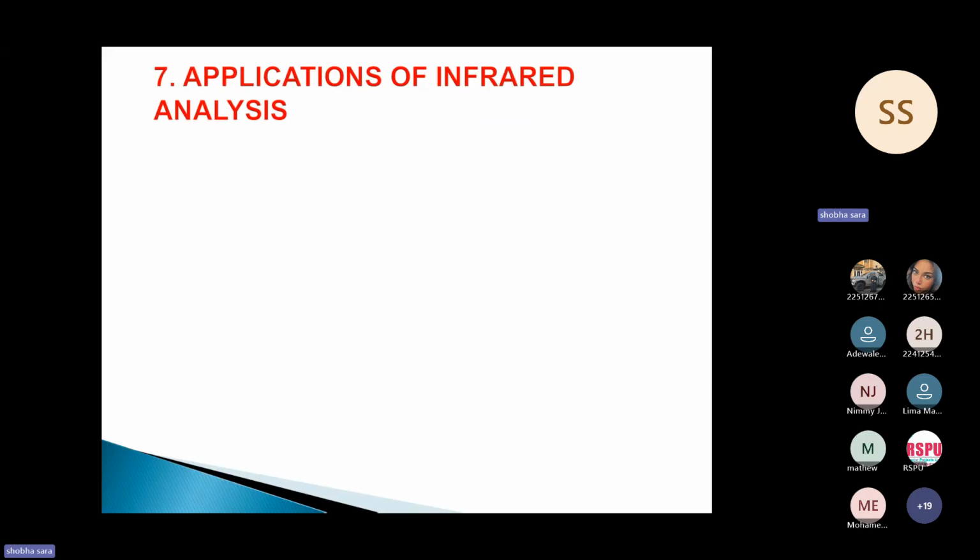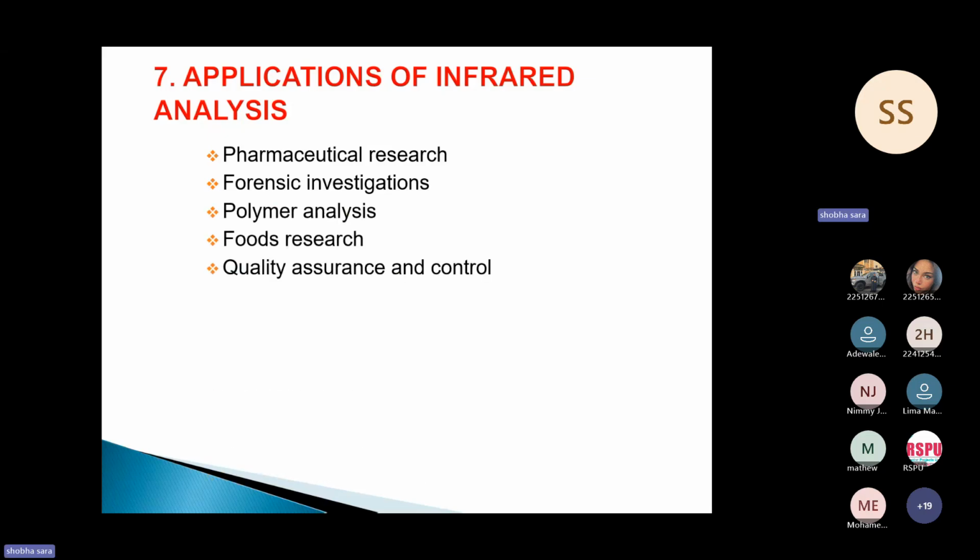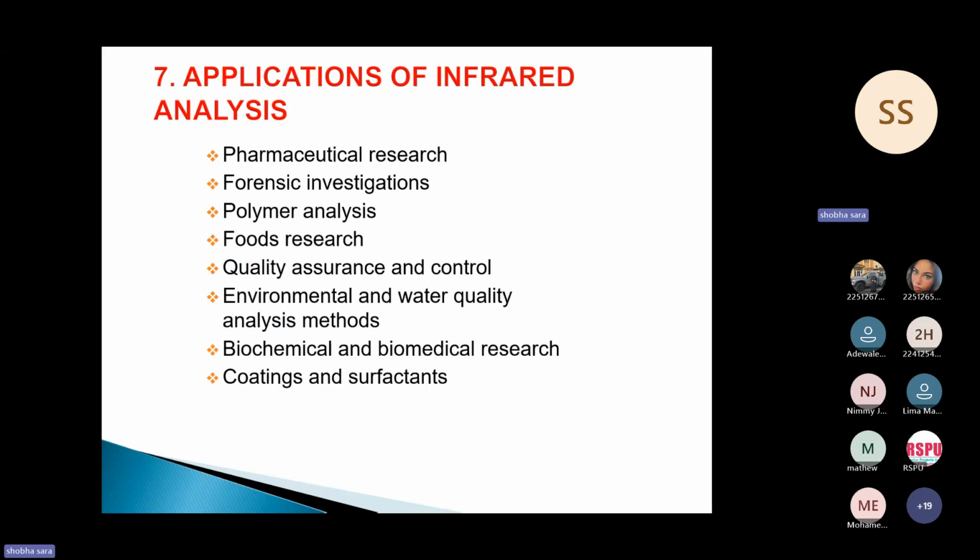Then let's come to the main point. What are the applications of infrared analysis? It is mind-blowing. They can be used in several fields and it is interesting also. I'll go one by one: pharmaceutical, forensic, polymer analysis, food research, quality assurance, environmental, biochemical, coatings and surfactants.